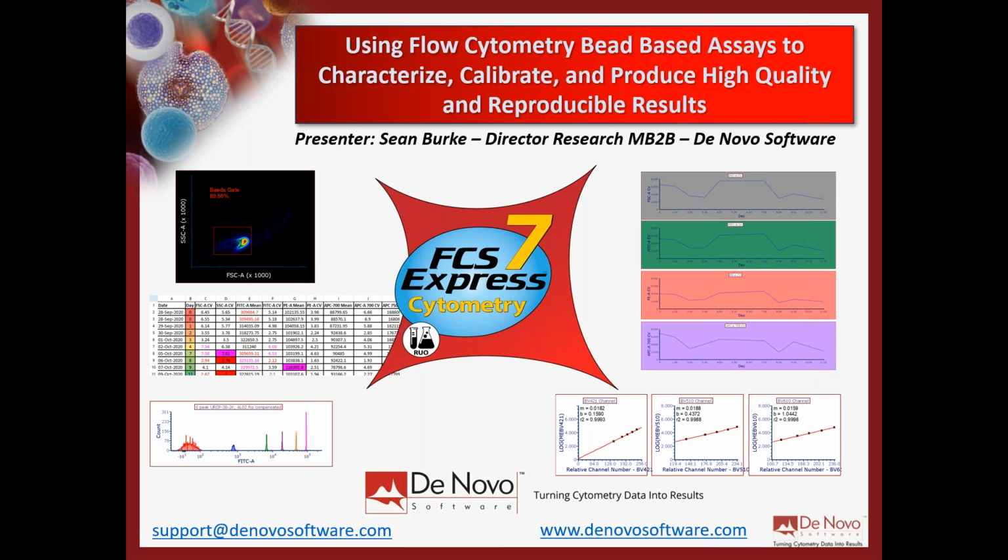As you move a gate, you can see how your CVs update across multiple longitudinal studies and things like that. So in this portion of the webinar, I'm going to pick up and we're going to talk about some of the data analysis from these beads in FCS Express.